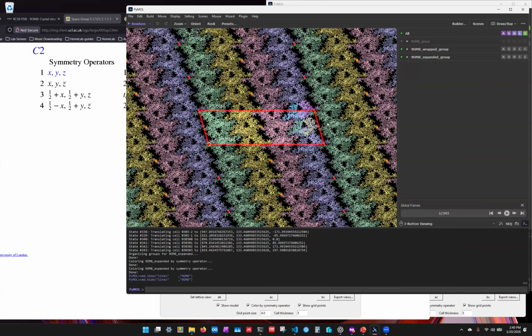The only reason people avoid it is because your number of observations drops, since you have to account for a lot more parameters to define. When you have a lot of symmetry operators, that limits the positions of the atoms that you actually have to solve. Right now this has 4 copies in the asymmetric unit, but 16 copies in the unit cell.